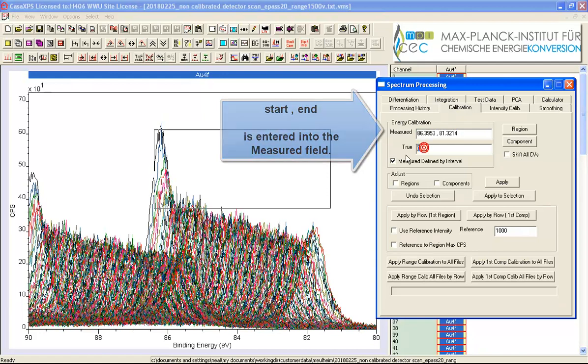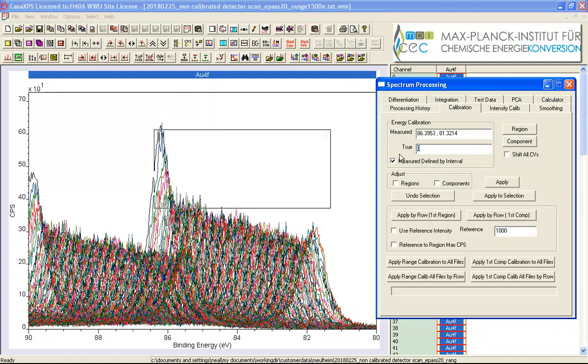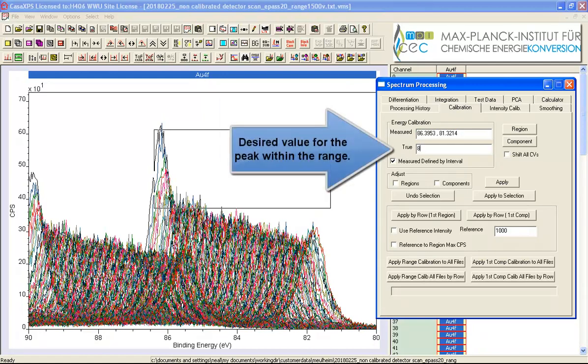So now all we have to do is enter the value that we would like to calibrate to, so 84, and we'll press apply.